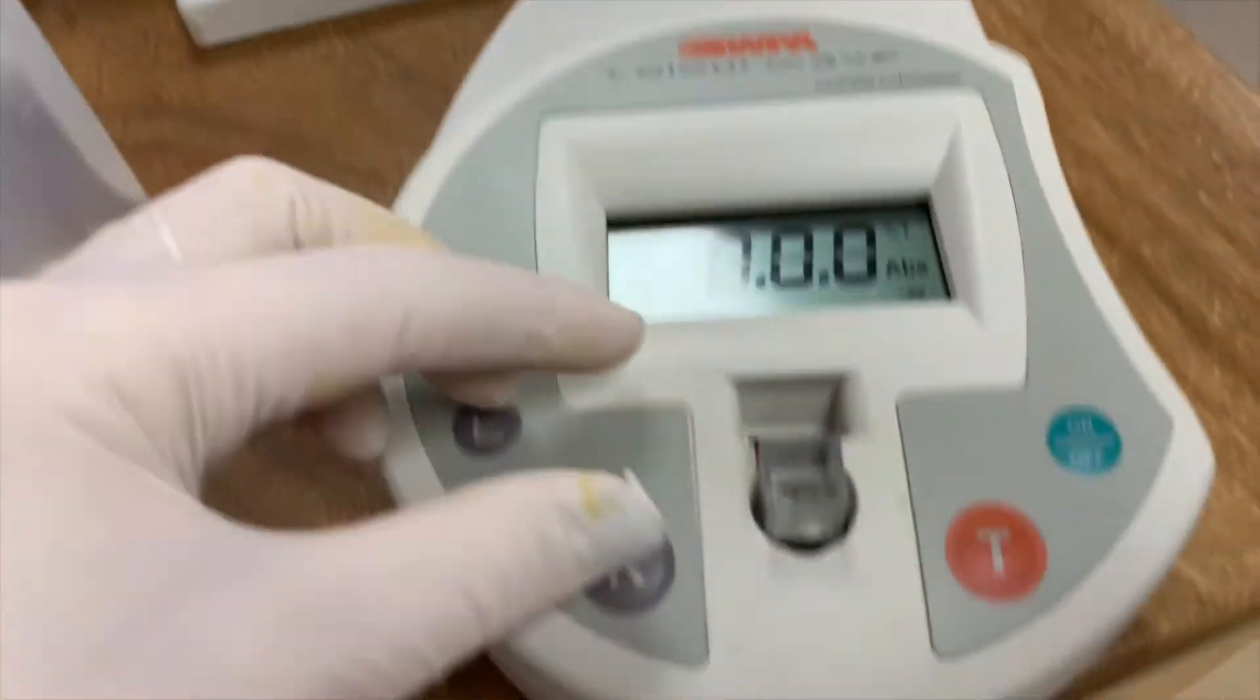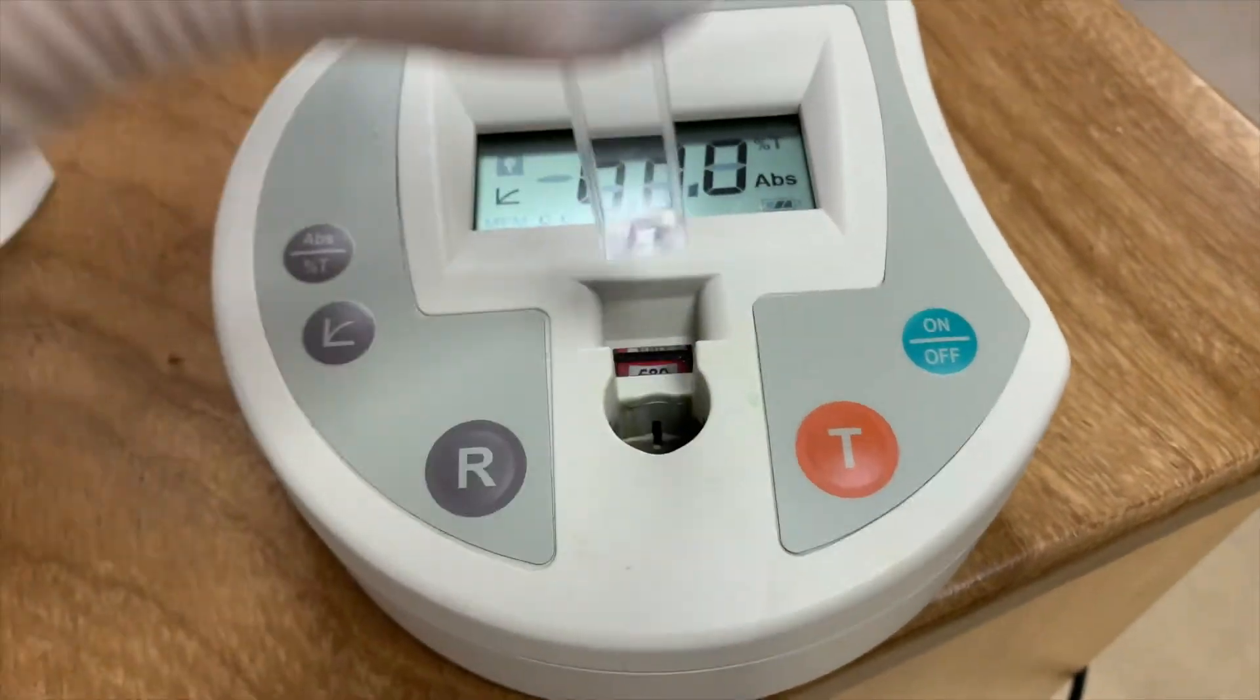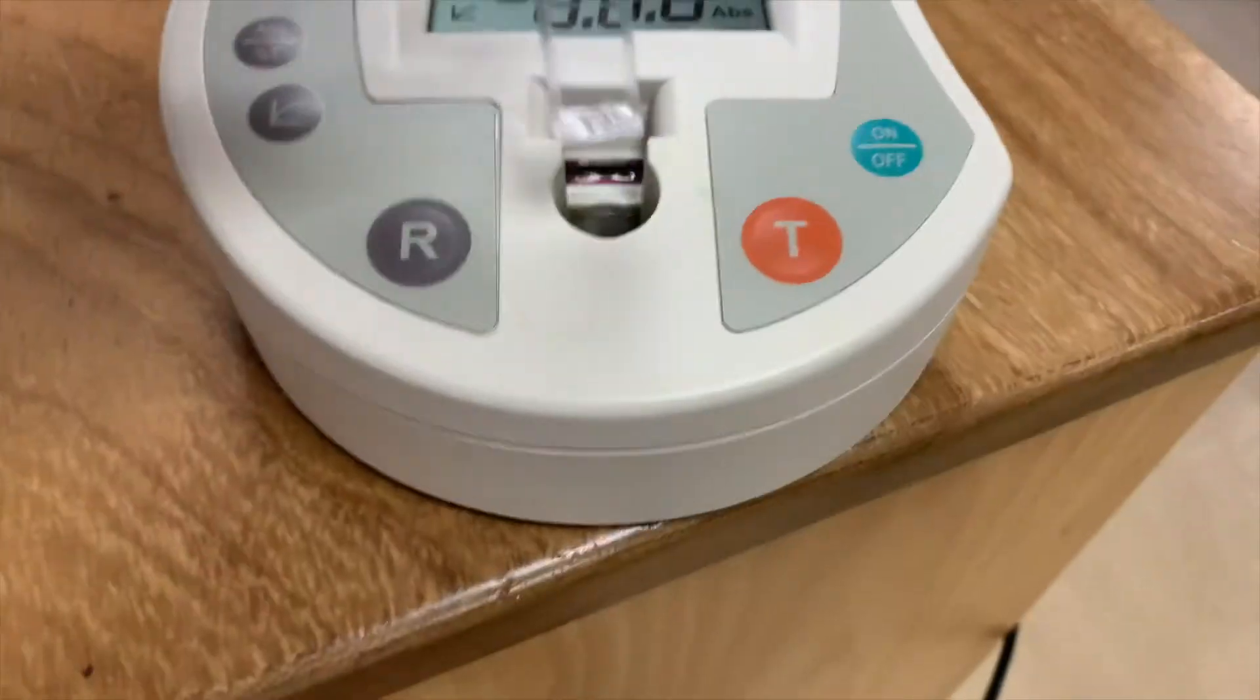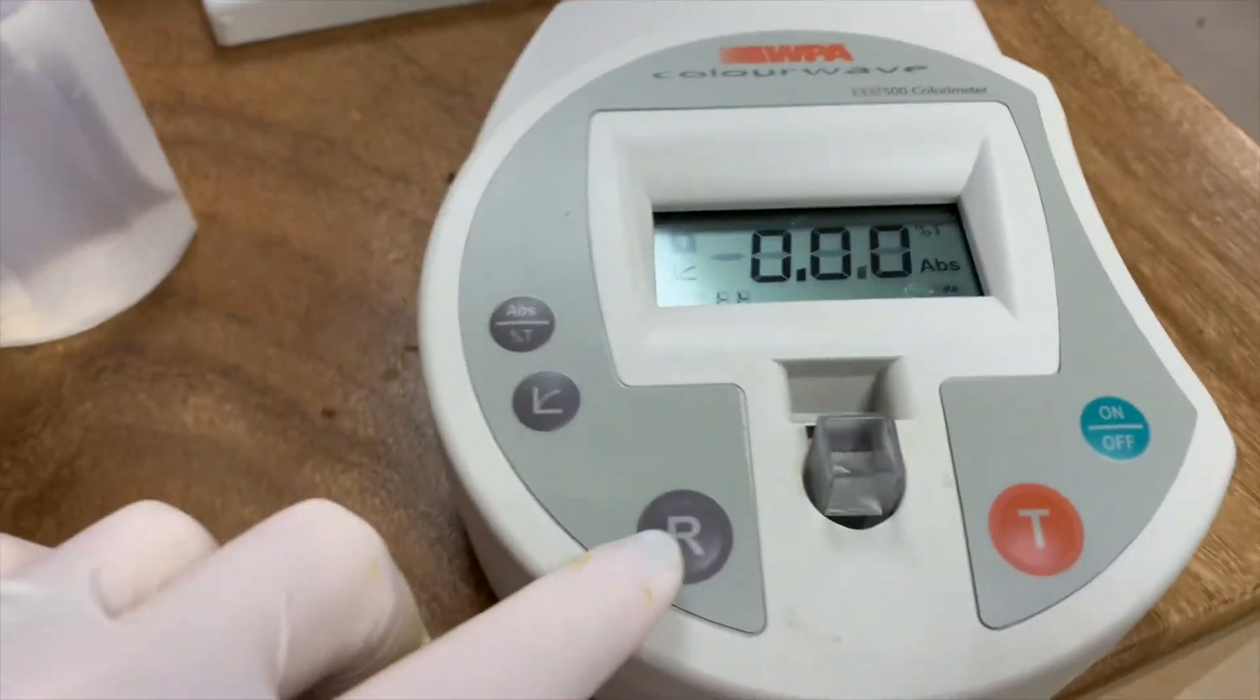Seeing as the colored solution you are testing is blue, set the colorimeter to red light and use distilled water as a blank to set the reference for absorption.